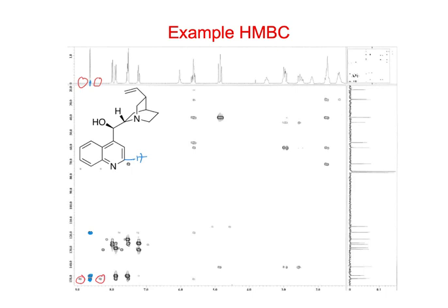What we're seeing on a number of these in this case is that these are actually the one bond couplings, and they're showing up as the C13 satellite peaks. Okay, so we see one there, and for almost all of these we see some one bond coupling.